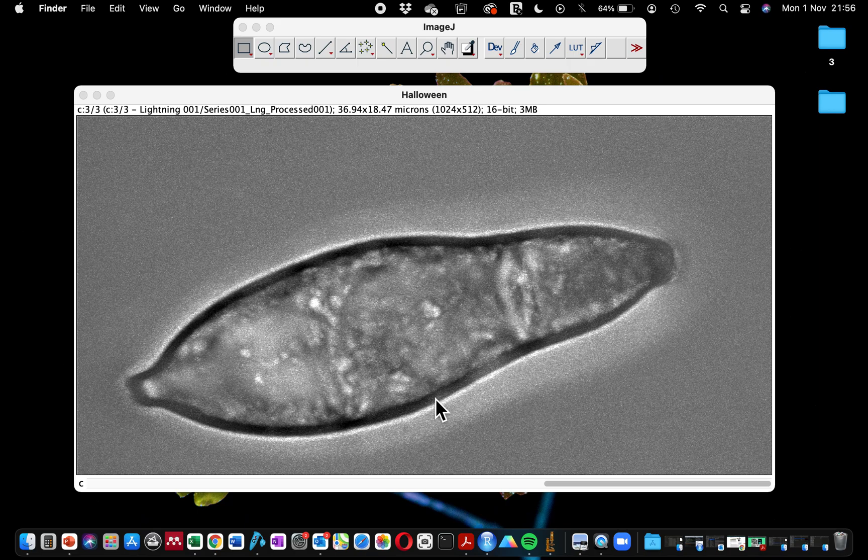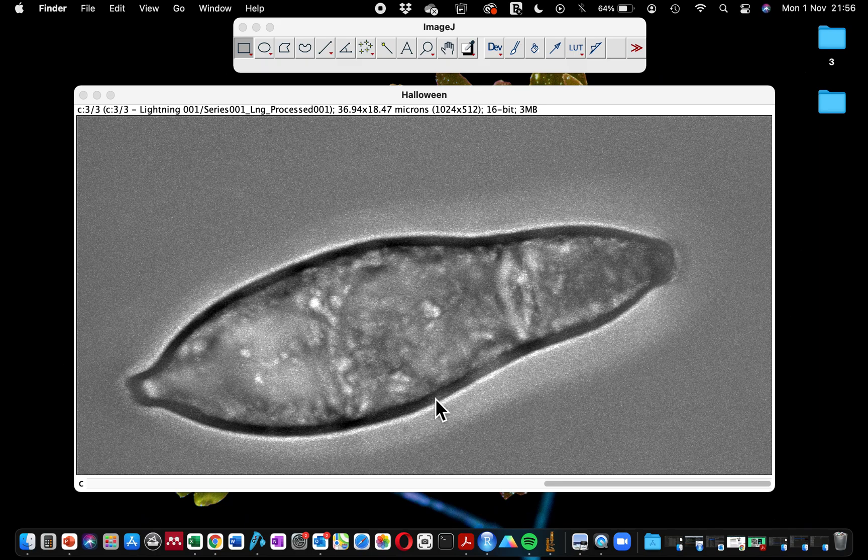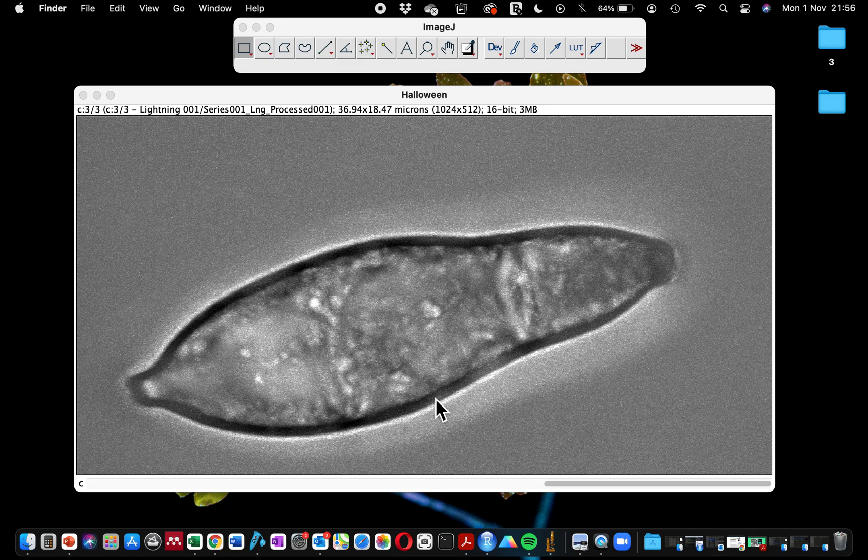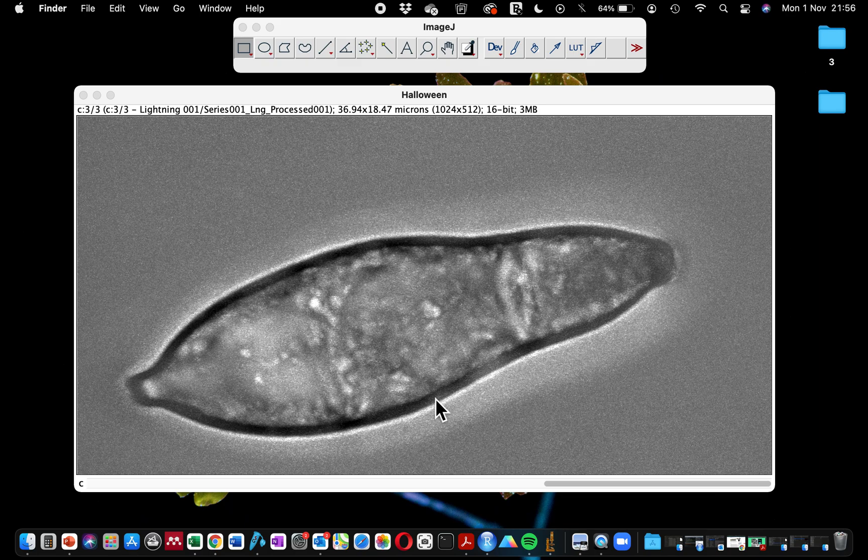For today's tutorial, I'm going to show you how to solve the problem with the scale bar not showing on TIFF format images. I'm sure some of you have at one point observed that when you save your microscope image that already has the scale bar on it, when you save it with the TIFF format, the scale bar does not show when you then open the image later on.